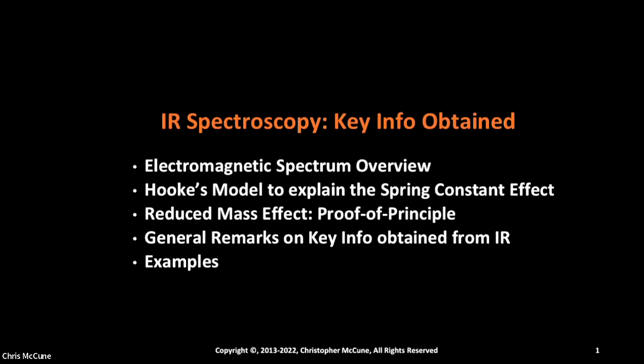IR is best used in parallel to other spectroscopy methods. For example, IR is really useful when you have an NMR also available. Okay, you can't really determine a structure alone just by IR, but it does offer key information to the functionality that could be present in the structure. But usually other spectroscopy methods are present or available as well.